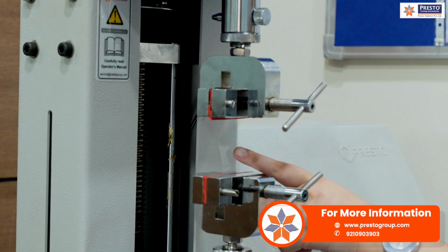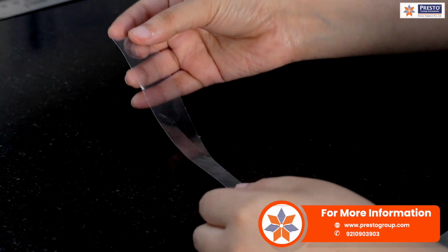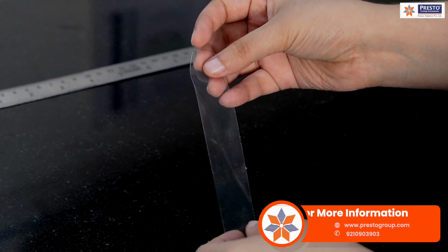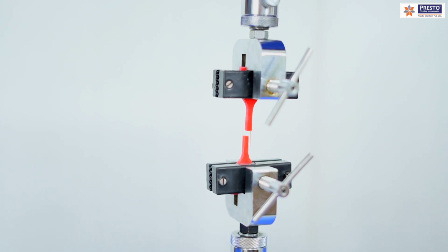First point, not aligning the film properly. Second, gripping too tight or too loose. Third, using films of non-uniform thickness. Also, never compare D882 results with ASTM D638, which is used for rigid plastics. They are for different materials and they have different rules.